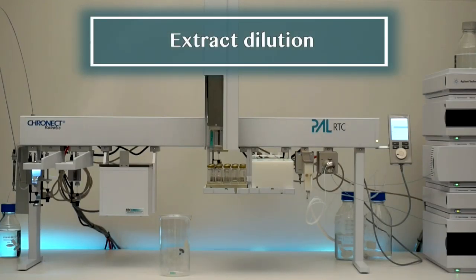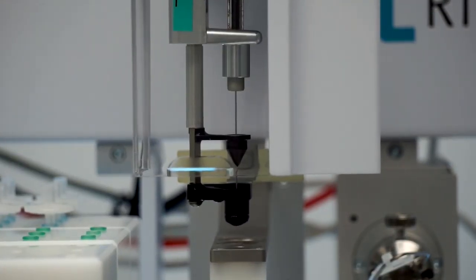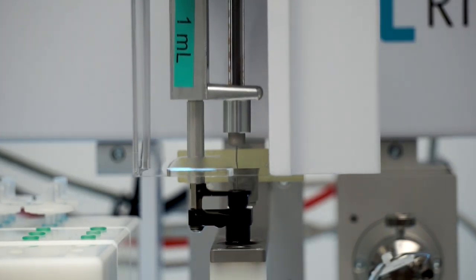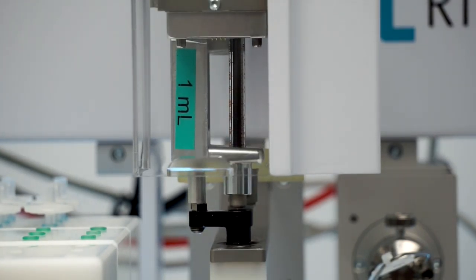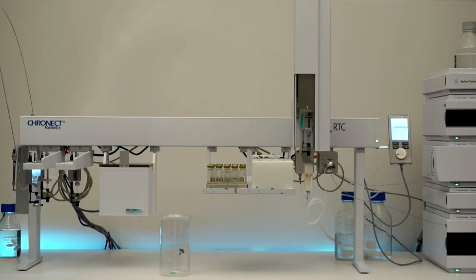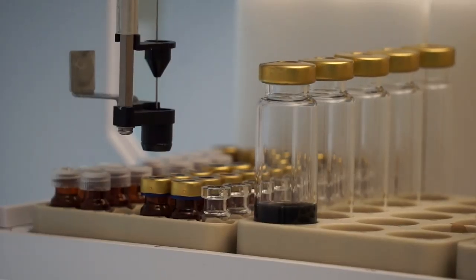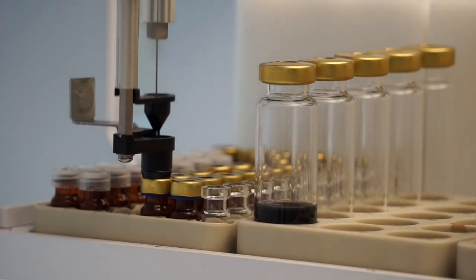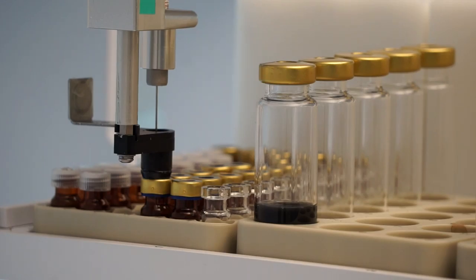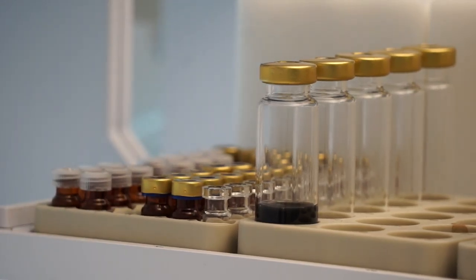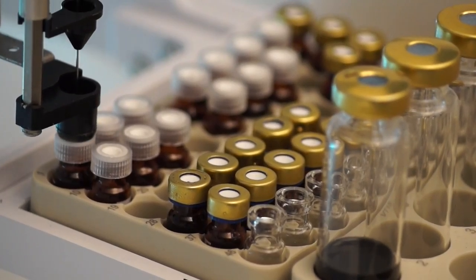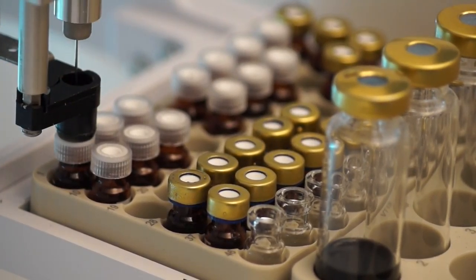Extract dilution. The syringe tool is flushed with the solvents at the wash station, then 10 µL extract from the extract vial with solenoid cap are transferred into the sample vial for dilution. Solvents are drawn into the syringe for dilution and also injected into the sample vial.